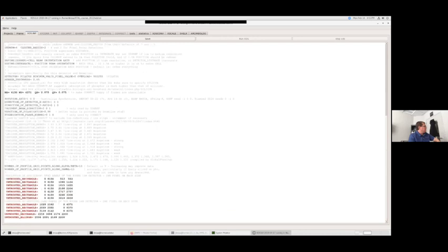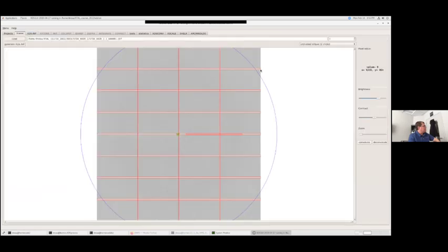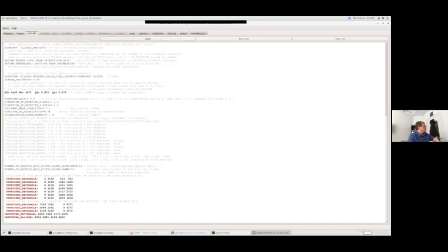All right. And then the other thing at the bottom is the untrusted rectangles. These are all those red rectangles drawn in here, just defined. They're defined as the upper left, the far left column, the far right column, the top row in pixels, and the bottom row in pixel numbers.